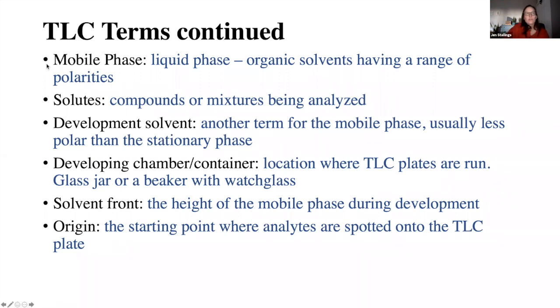Development solvent is used interchangeably with mobile phase. So development solvent and mobile phase are basically the same thing. The development solvent is going to be the hexane, and it goes in the bottom of our TLC setup, and you'll see that in the video. And that's where you place your TLC plate. So it works its magic, which you'll see later.